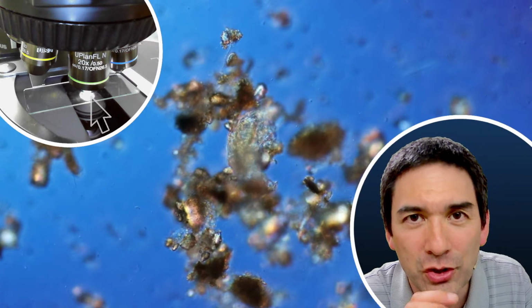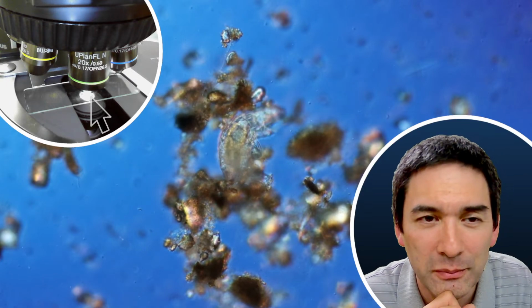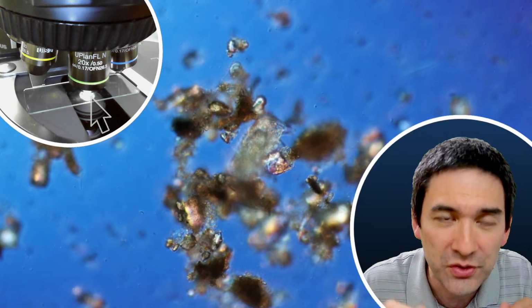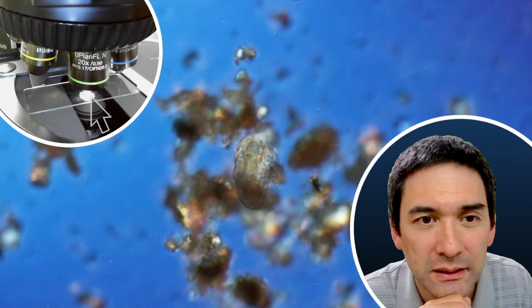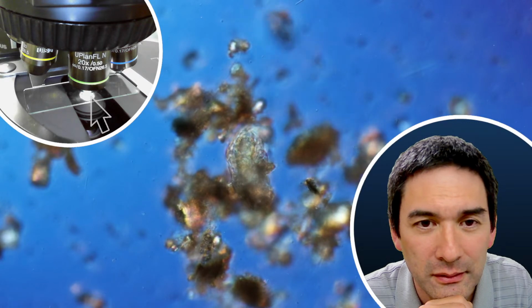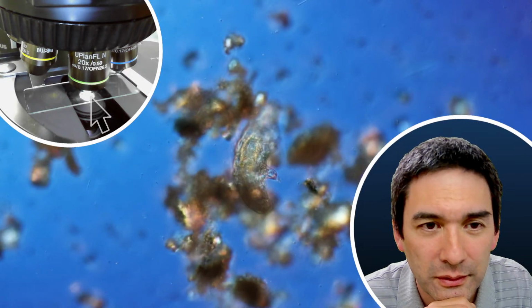I once managed to completely isolate a tardigrade, so without any other sediment or solid material around, and then it was always slipping. So it was kind of walking, but it was not able to move away too quickly, only very slowly. Yeah, here you can see that it's a little bit clumsy as it's trying to move forward.